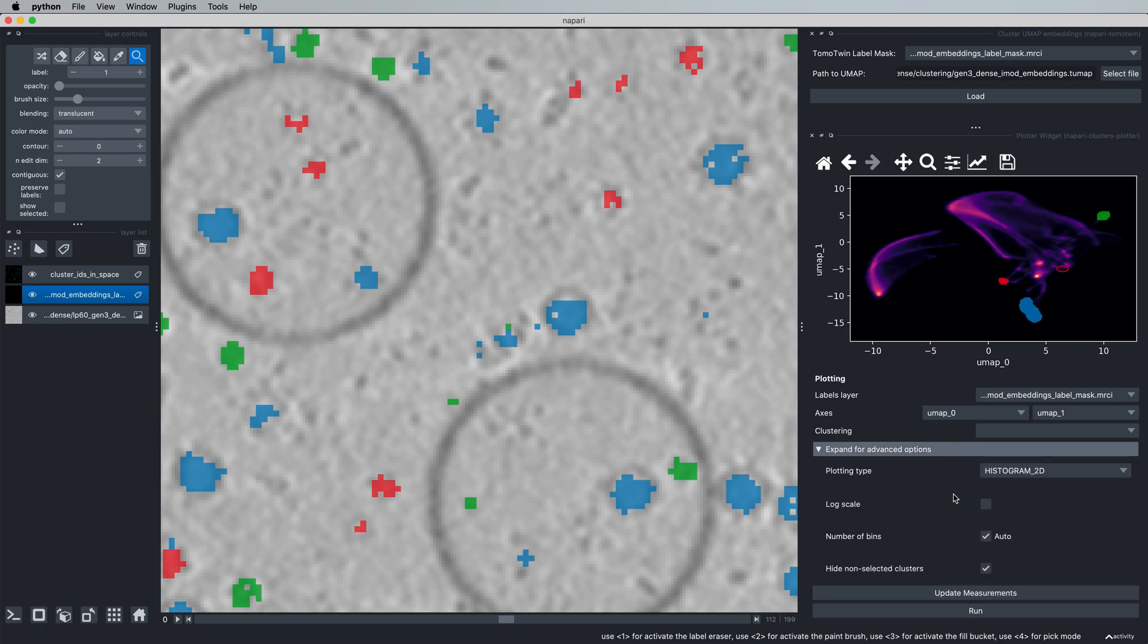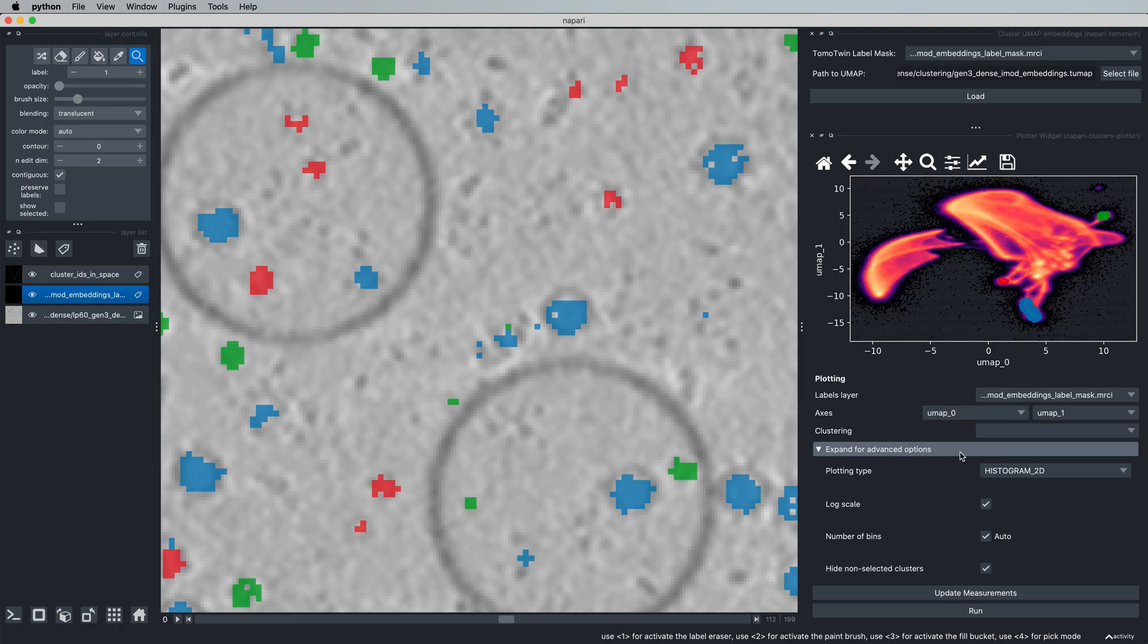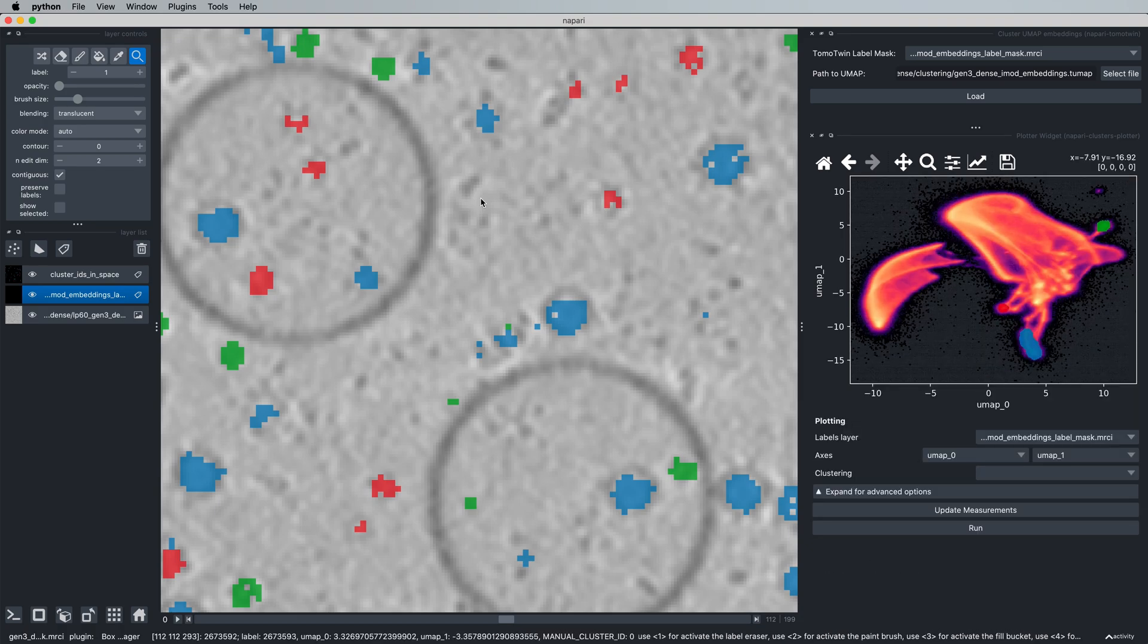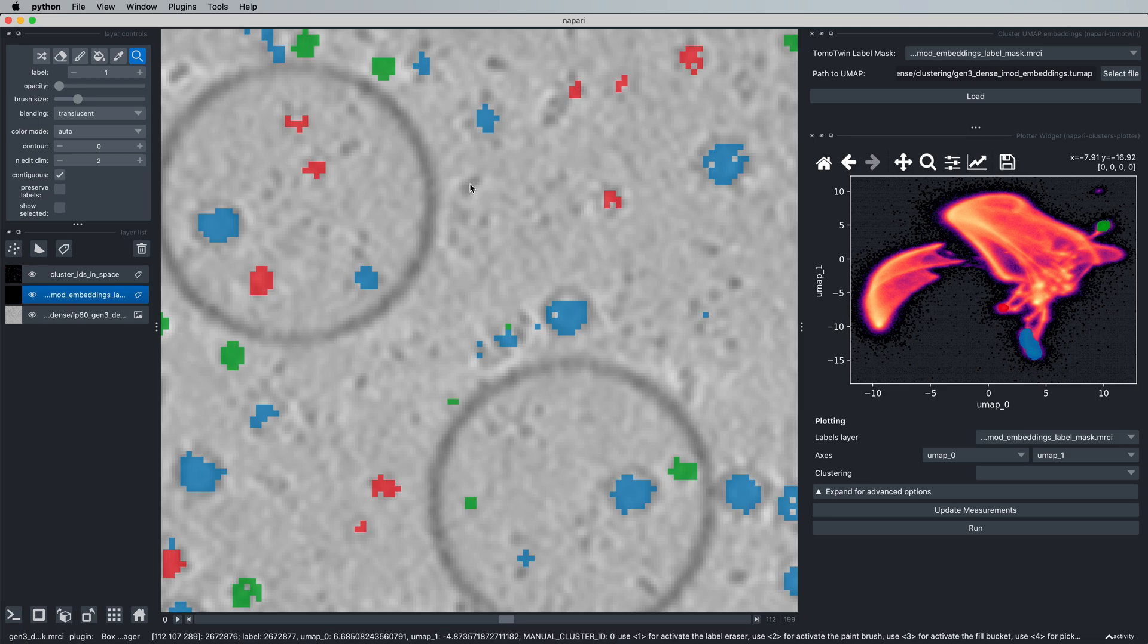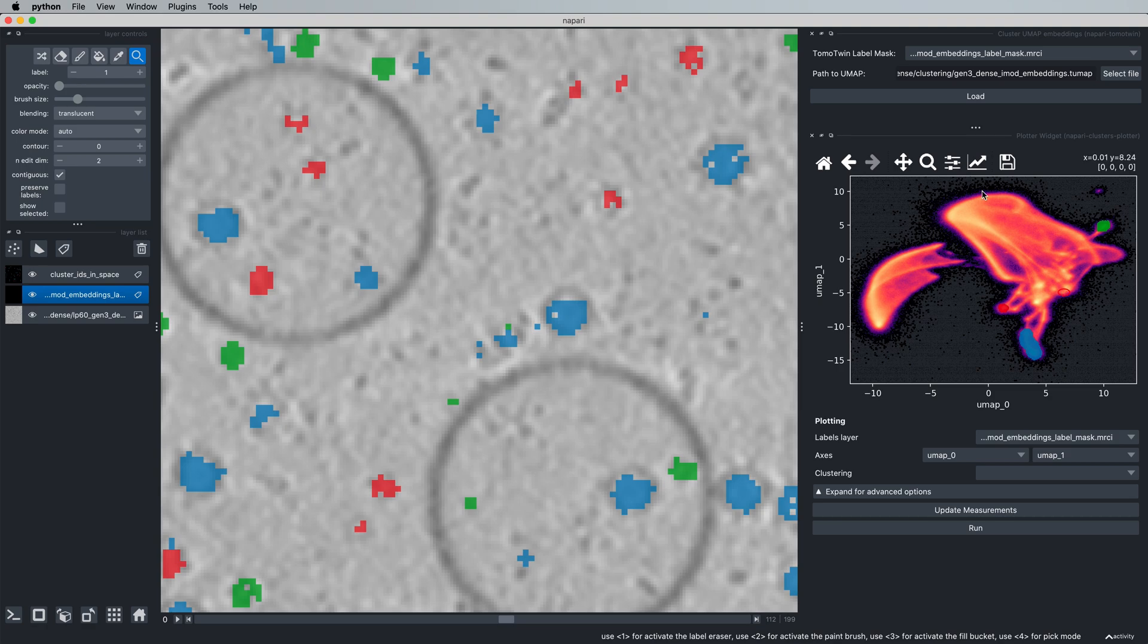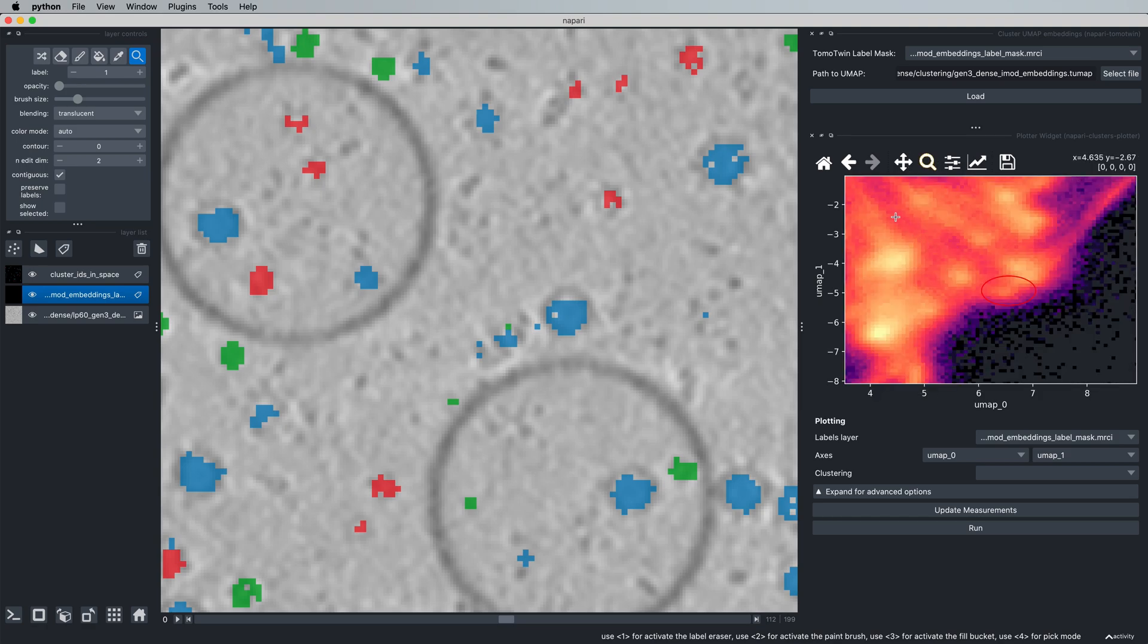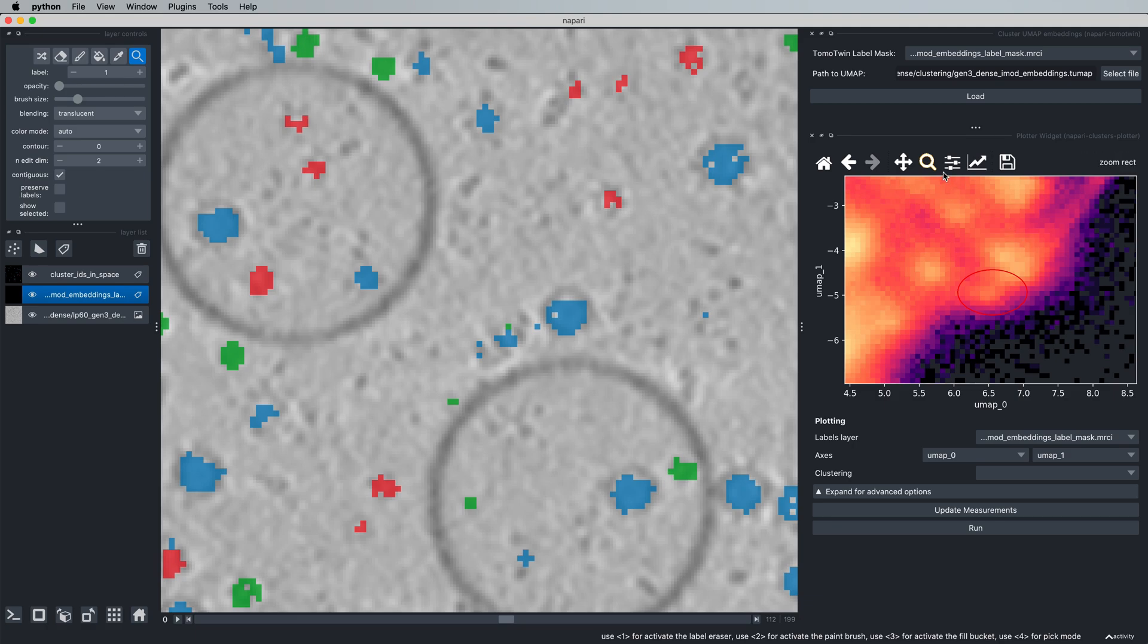If we come to advanced options, we can turn on log scale. This simply changes the scaling of the histogram to make some low copy number proteins easier to see. So again, we can come here in the tomogram, click, and we can see a red circle outlining here. If we change our zoom, we can see that there are in fact embeddings here.